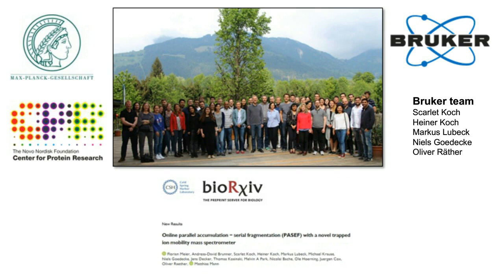I think we have time for a couple more questions. Have you tested the peptide mapping of a pure protein, say a 150 kilodalton antibody? Were you able to achieve 100% sequence coverage? Yeah, very interesting question. The short answer is no. We would guess that the very fast sequencing speed of PASEF will allow us to get close to these numbers, but as I said, we haven't tested this so far.